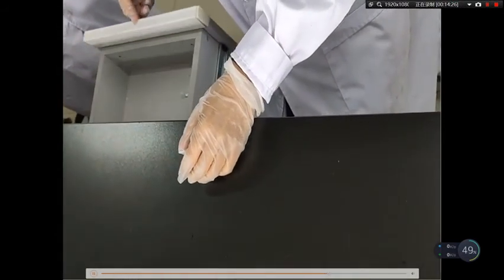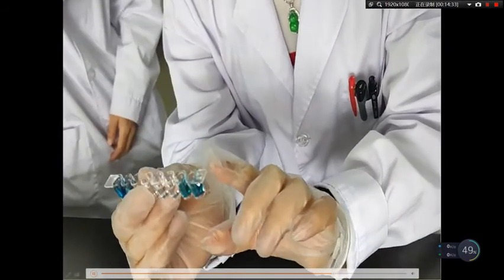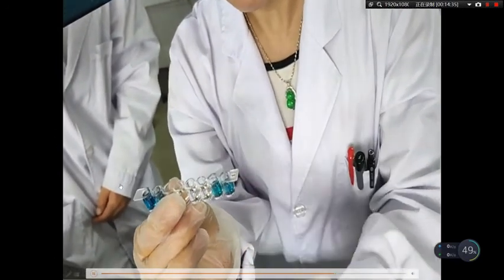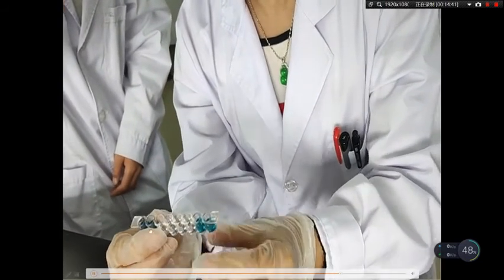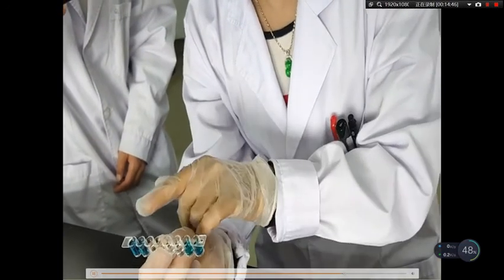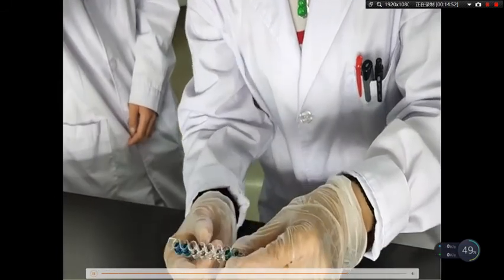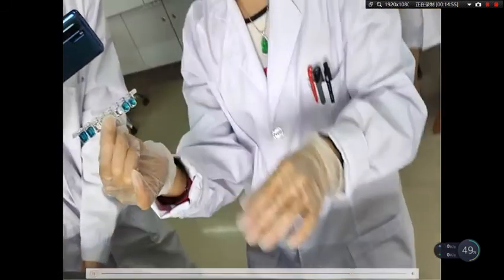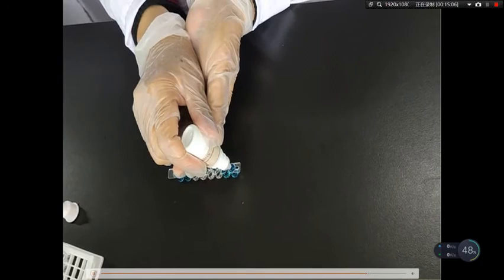After 10 minutes, we can see the positive control and the sample are blue, while the negative and blank are colorless. And this indicates the sample gives a positive result. Then we add stop solution to the wells, 1 drop per well.